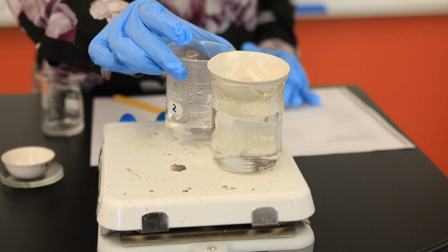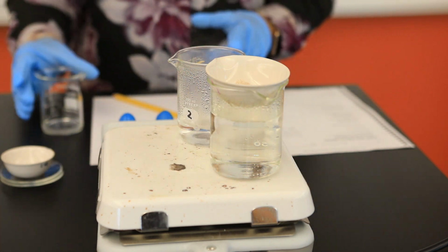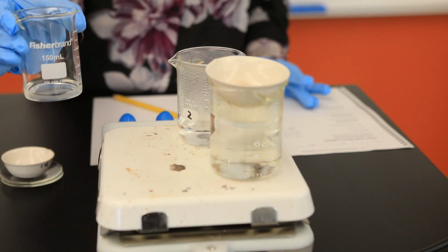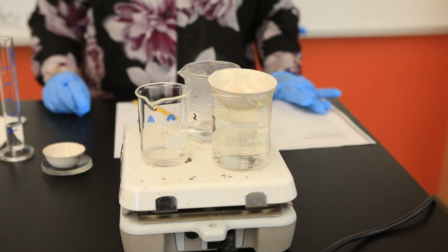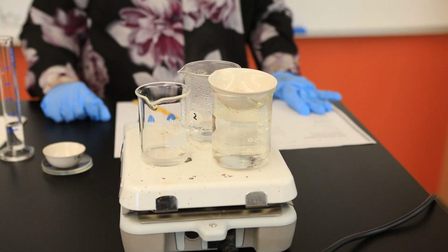Okay, so you should also notice that the salt solution is beginning to boil. In addition to that, now I'm going to do my third setup. My goal now is to try to recover my calcium carbonate. So here's my solution of calcium chloride. We need the solution. I'm going to place it also on the hot plate. This solution must come to a boil, and then we're going to let it boil for approximately 5 minutes.